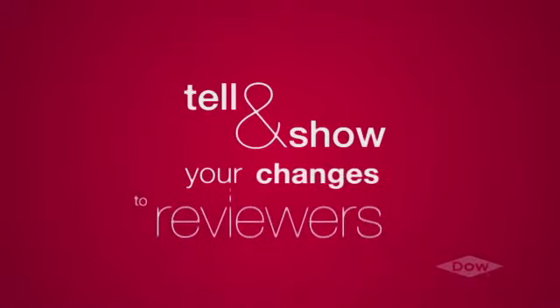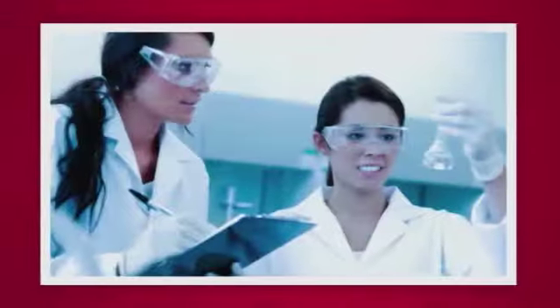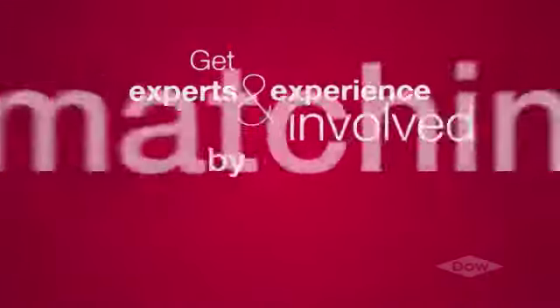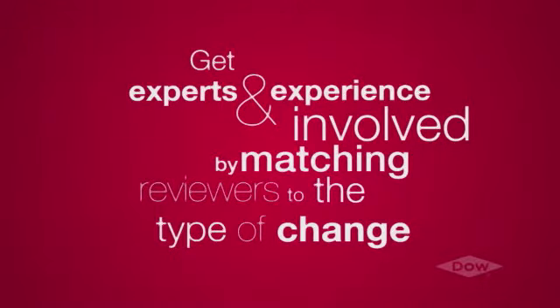Inviting a coworker or supervisor to be your second set of eyes during a change review can help identify and address potential issues. Don't just sit in an office and talk about your changes. Go where the action is, like the lab hood or bench. Tell and show your reviewers exactly what you will be doing. With everything set up and in sight, you and your reviewers may see things that can be modified to further enhance safety. If you involve a variety of people with different expertise and experience in your review early on, you and your project will benefit.